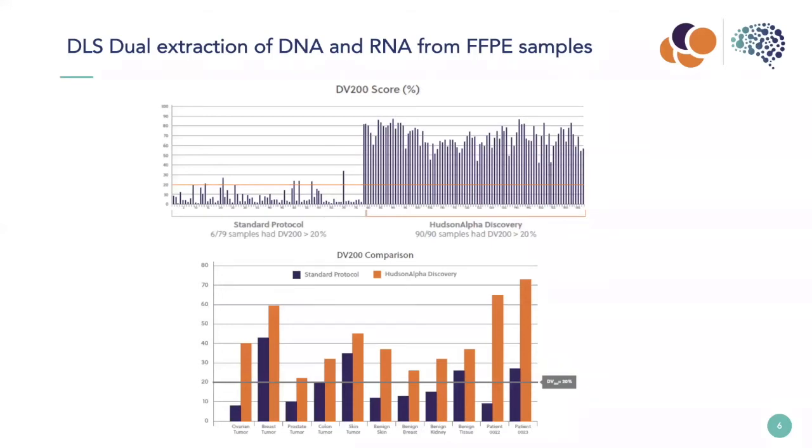And that is very, very simple, that a significant amount of intact RNA is in fact present in the majority of FFPE samples. And it is through the extraction process that RNA is often degraded. So if the extraction process is modified to allow a very thorough but gentle extraction and retention of that higher molecular weight RNA material, you can significantly change the quality control and subsequent use of that material in downstream assays. And what you're looking at here is a comparison of that.